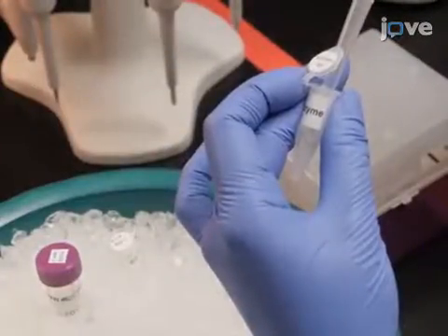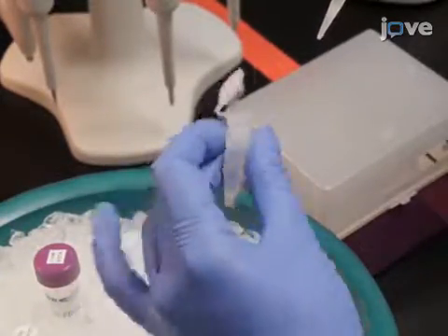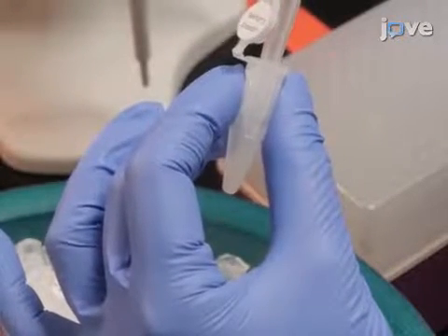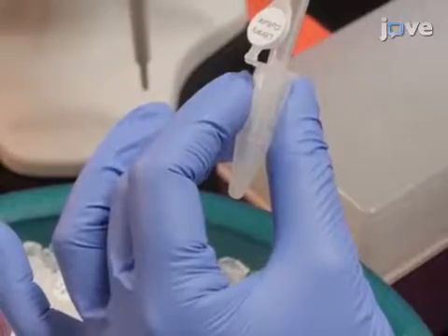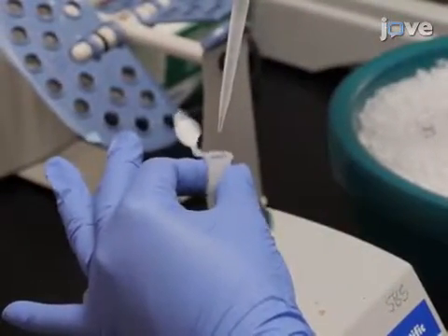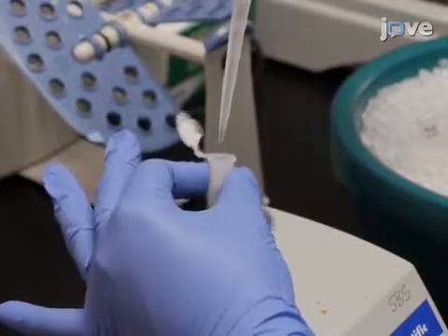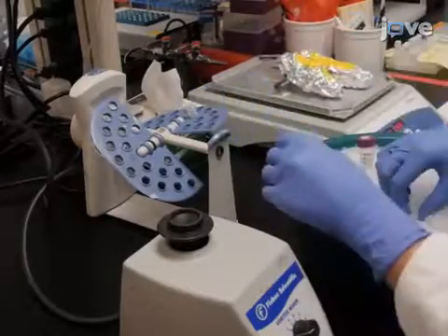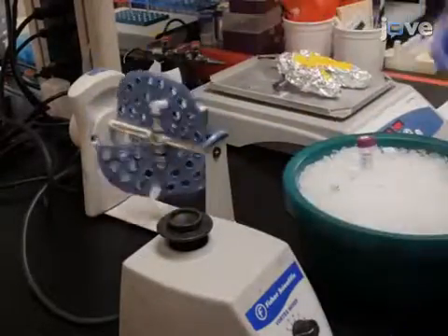After removing the supernatant, use 350 microliters of ice-cold FB supplemented with 3.5 microliters of 10 milligrams per milliliter lysozyme to re-suspend the pellets. Next, while slowly vortexing the tubes, add dropwise 700 microliters of 1 millimolar EDTA. Then incubate the tubes on a tube rotator at room temperature for 20 minutes to mix the samples.